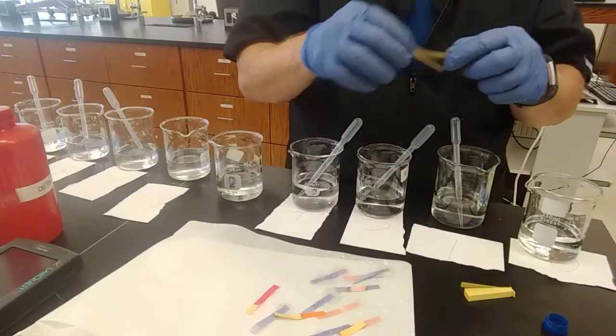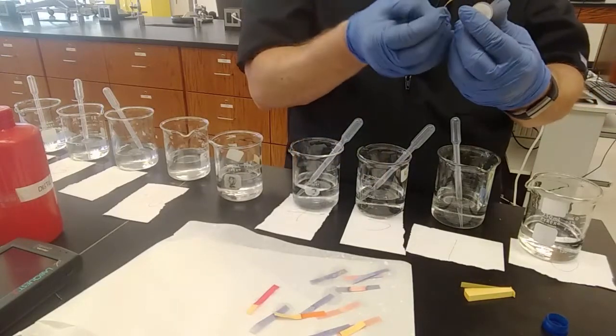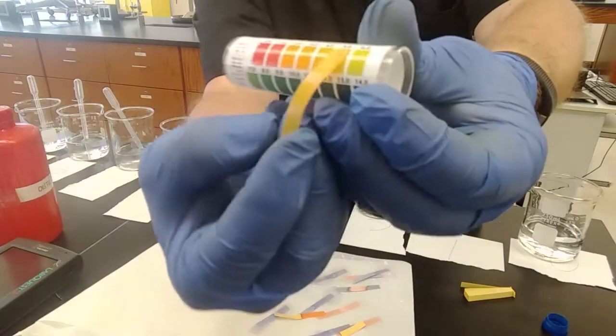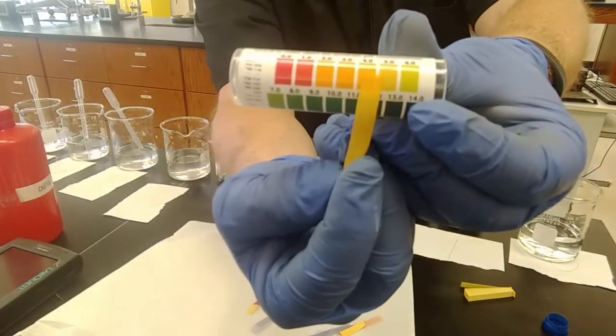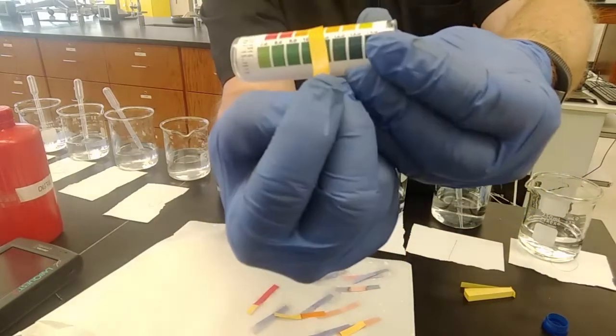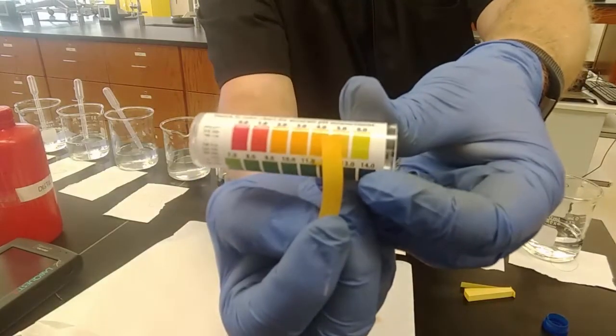Let's try 3. Expecting a 3. To me, it's a 5. It's definitely not a 3. To me, it's a pretty much exact match for a 5.